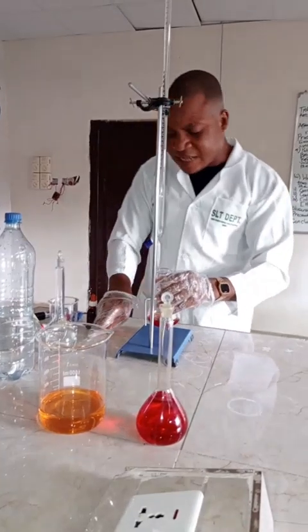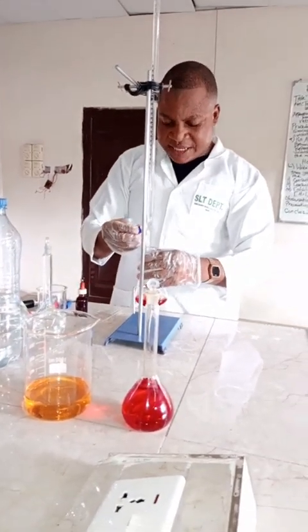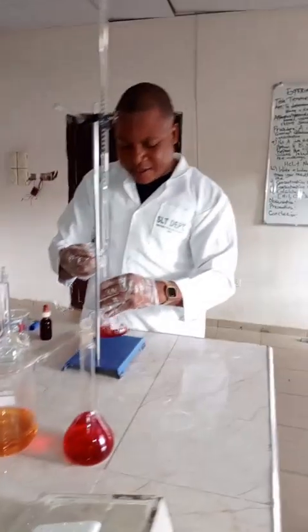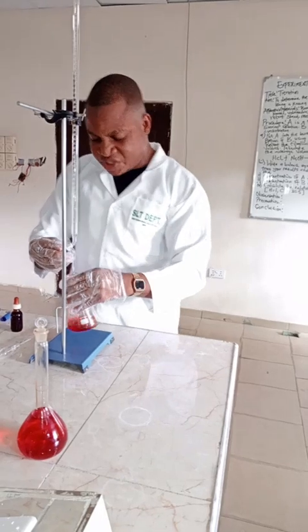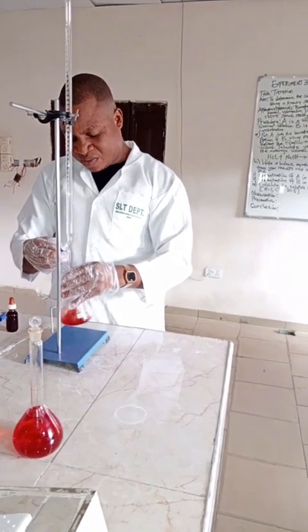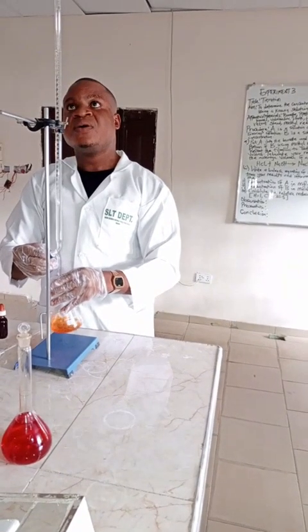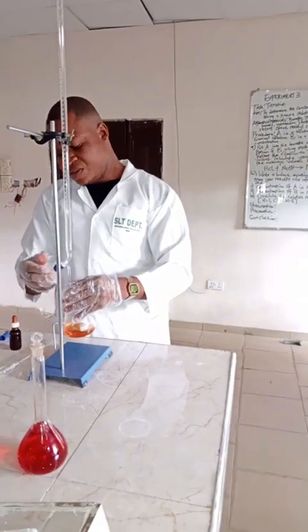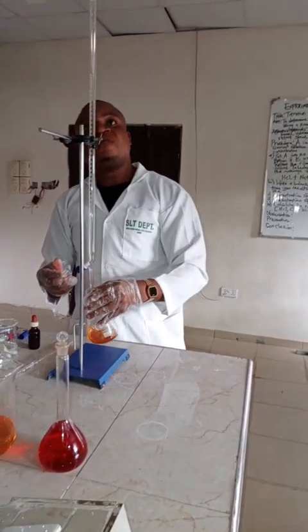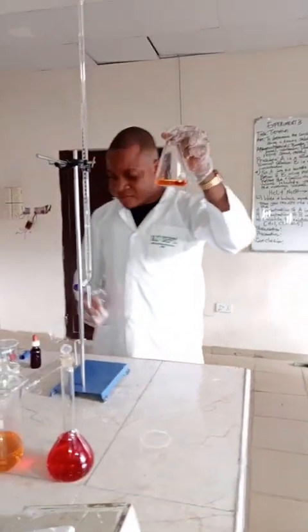So I'm going to titrate it now. Titrate by what? Swirling, continuous shaking until you note a change in color. Now, from the titration, there's already a change in color.